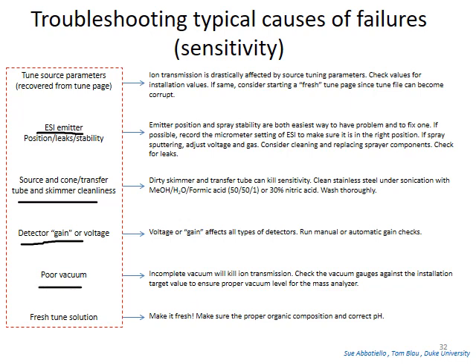Insufficient vacuum affects sensitivity to a great extent. As said, incomplete vacuum will kill ion transmission. Check the vacuum gauges against the installation target value to ensure proper vacuum level for mass analyzer.